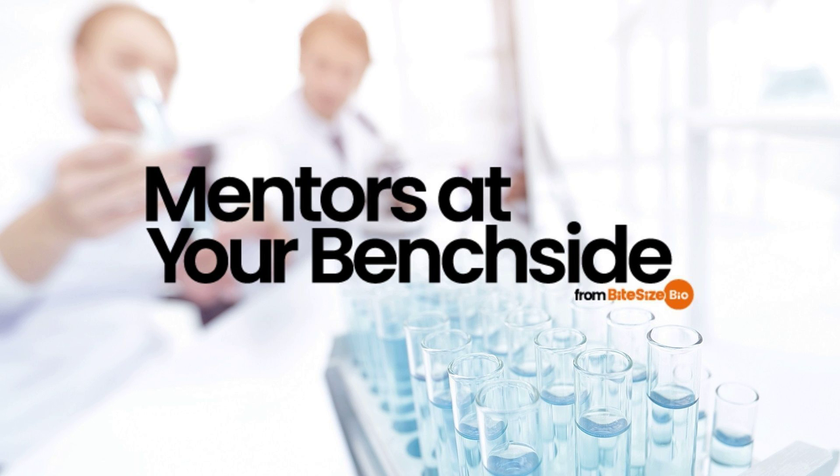Now you can use OD600 measurements to determine your bacterial culture growth stage. Measuring the OD600, or the optical density at 600 nanometers, is the easiest way to gauge the bacterial culture growth stage. Optical density measures the degree of light scattering caused by the bacteria within a culture. The more bacteria there are, the more light is scattered.